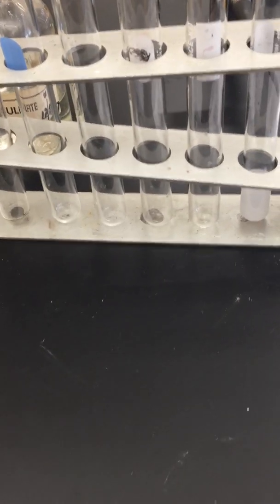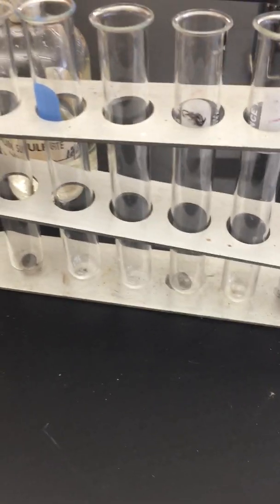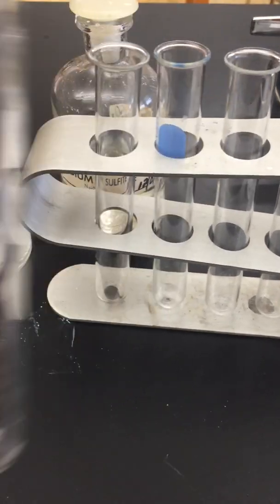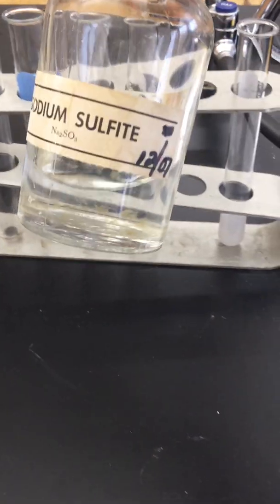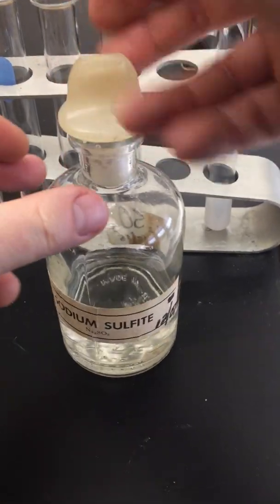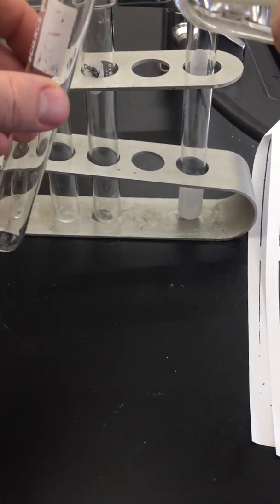For the other one, I take about 5 milliliters of sodium sulfite. Here's the sodium sulfite. Add it to my test tube.